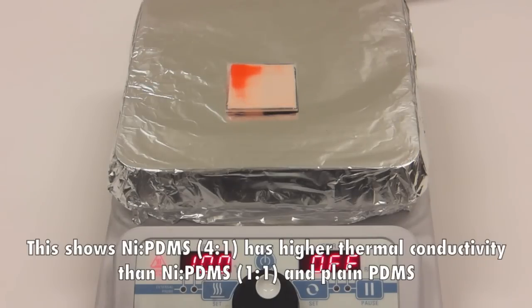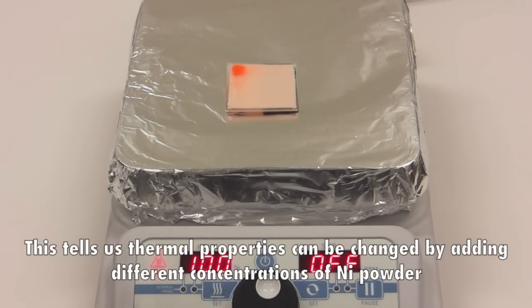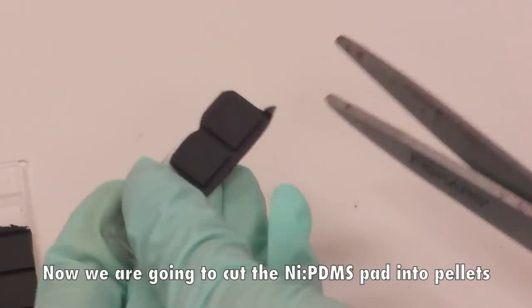This shows nickel PDMS 4-to-1 has higher thermal conductivity than nickel PDMS 1-to-1 and plain PDMS. This tells us thermal properties can be changed by adding different concentrations of nickel powder. Now we are going to cut the nickel PDMS pad into pellets.